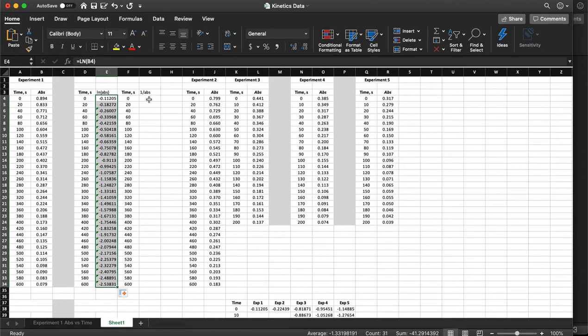And so, instead of doing what would have been like 30 some calculations and having to do each of them individually, I did the calculation one time effectively when I entered it in this first box, and was then able to instantly copy it and have it do all the other calculations for me. So that's a really, really useful thing to know how to do in Excel, and it makes life much, much easier.